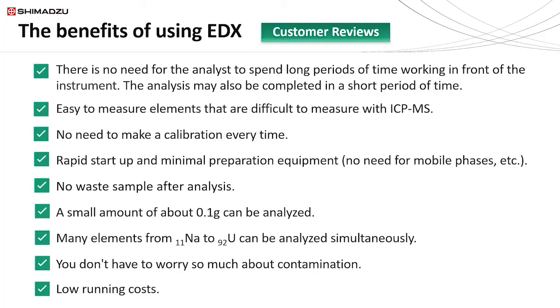Many elements from sodium to uranium can be analyzed in a simultaneous fashion. You don't have to worry too much about contamination, and the running costs are low. The main consumable cost is actually electricity, which is equivalent to that of a desktop computer.